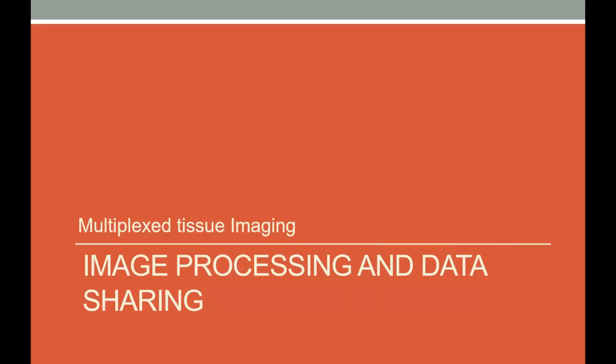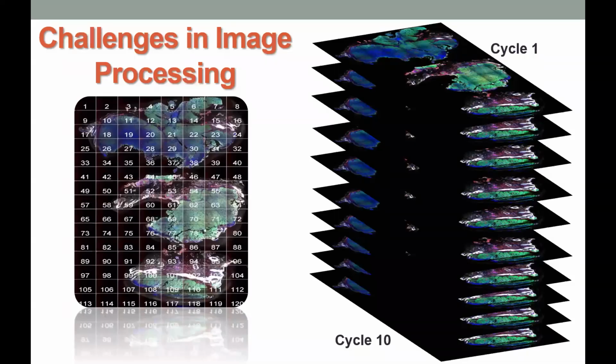Okay, so alongside the experiments, we actually developed multiple software tools to help us either process these images or share these images. Here I will focus on two of them. One is what we use for tissue image processing. The main issue is that most of our research requires a whole slide image scan, as you can see right here.